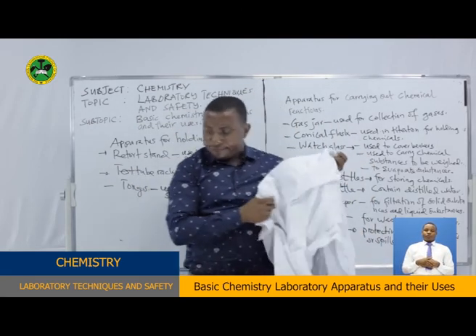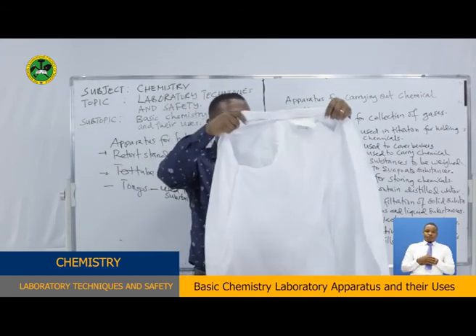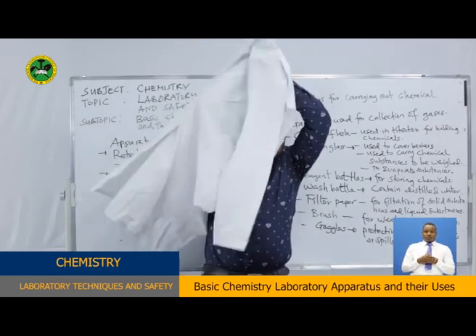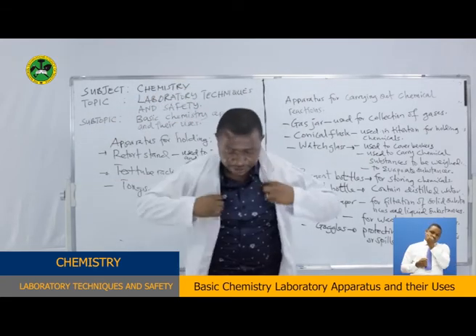We can also have a lab coat. You can see it here. This is the lab coat. You can decide, put it on. This is called a lab coat.